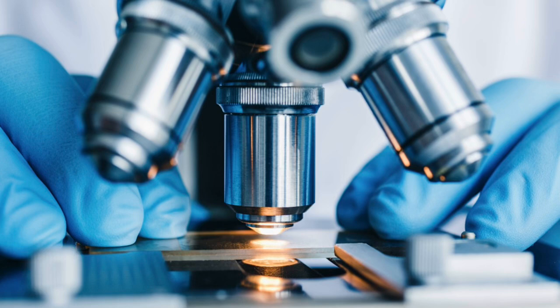One of the most commonly used microscopes is the compound microscope. This microscope is typically used to examine biological evidence such as blood cells, pollen, fibers, and plant material. Compound microscopes provide high magnification but produce a flat two-dimensional image. While this limits depth perception, it is extremely effective for analyzing cellular structures and small particles.